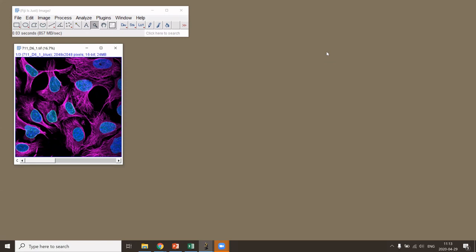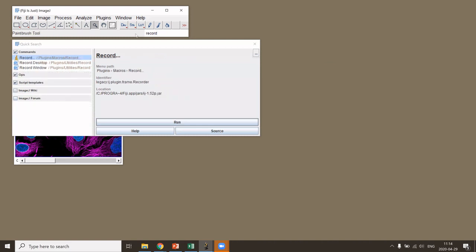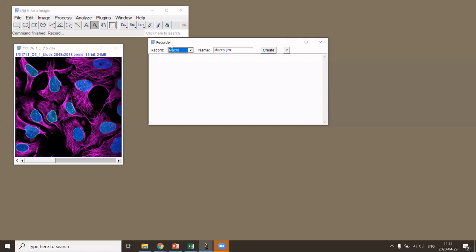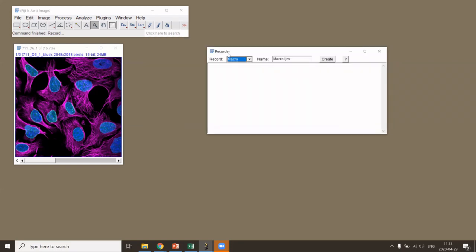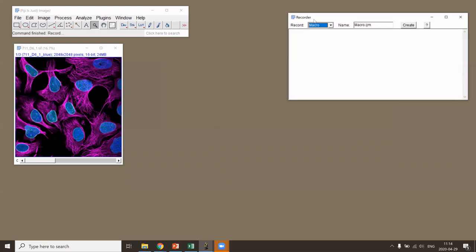This session is about automating these kinds of workflows — moving away from clicking and teaching Fiji to do things automatically. The most important command for this is the Recorder. You open it via the Record command, and it records whatever you do in Fiji and translates it into the ImageJ Macro Language. Make sure the language is set to ImageJ Macro, which is also the default.